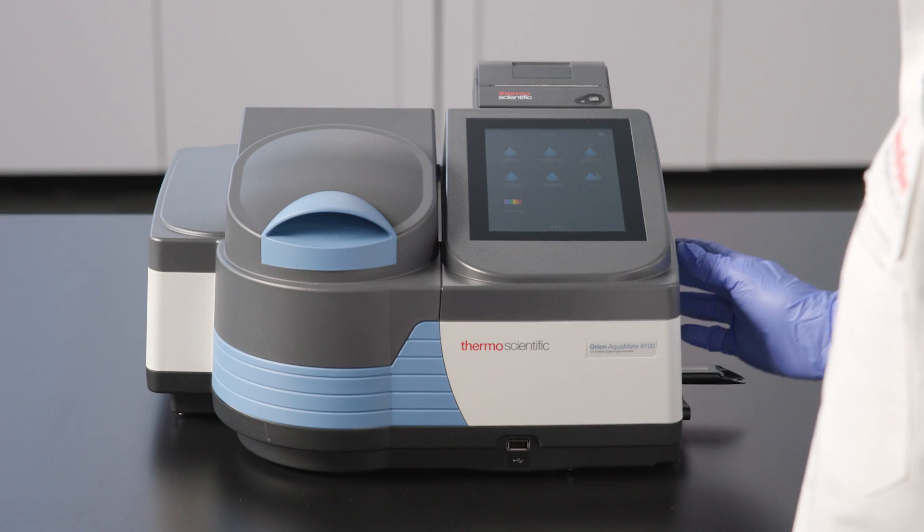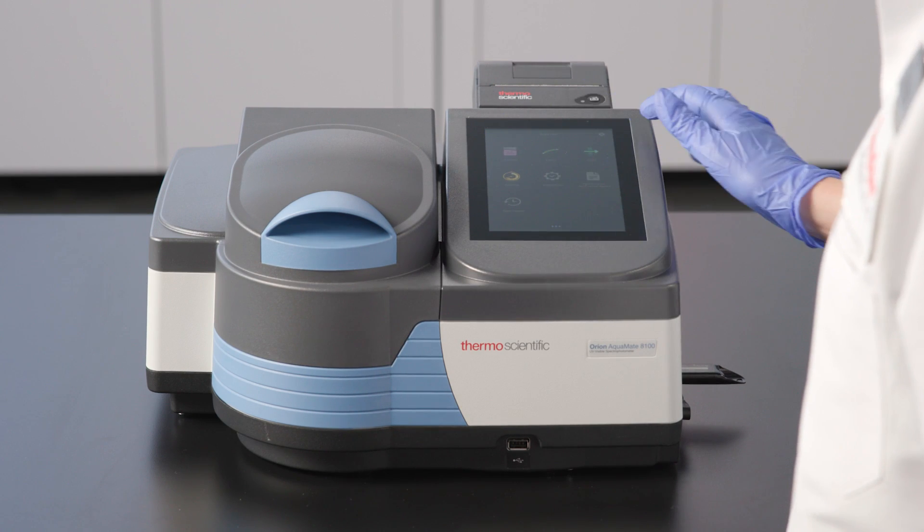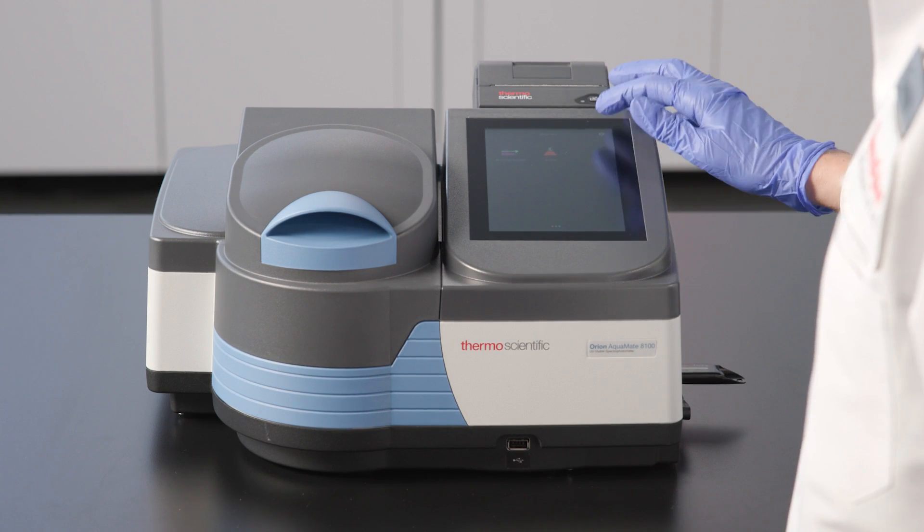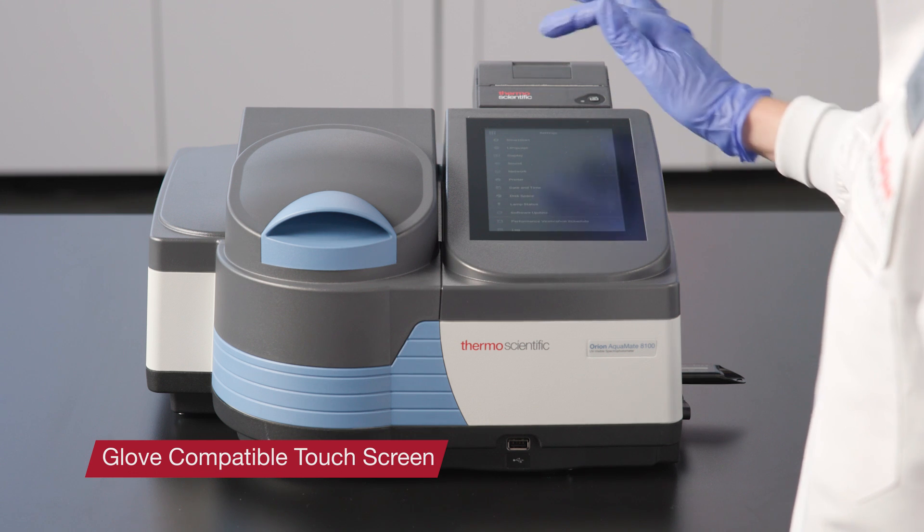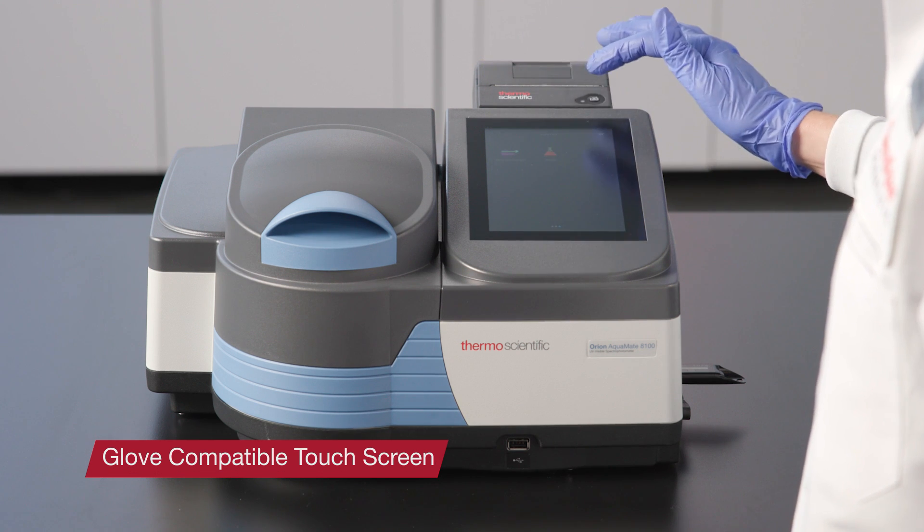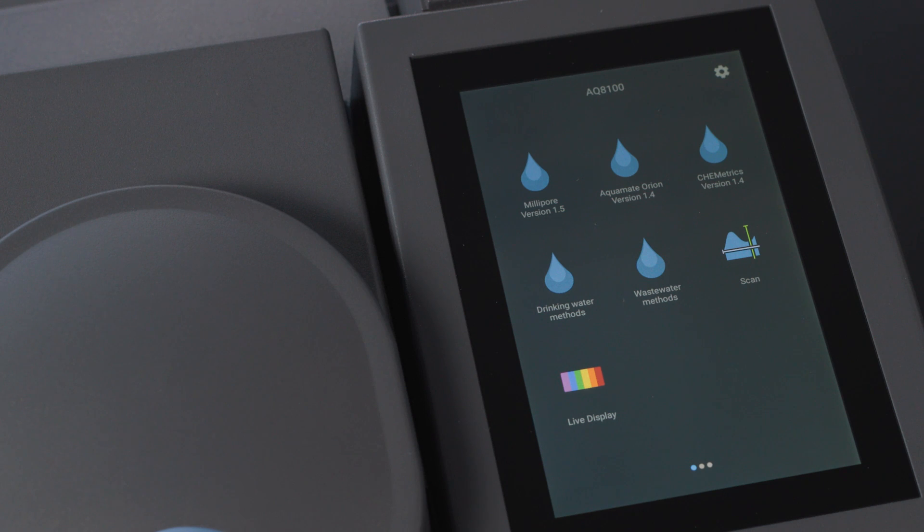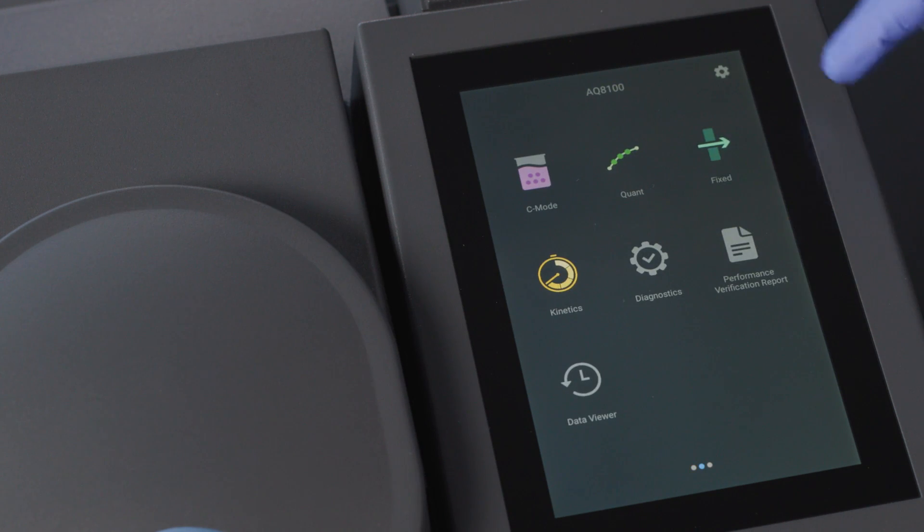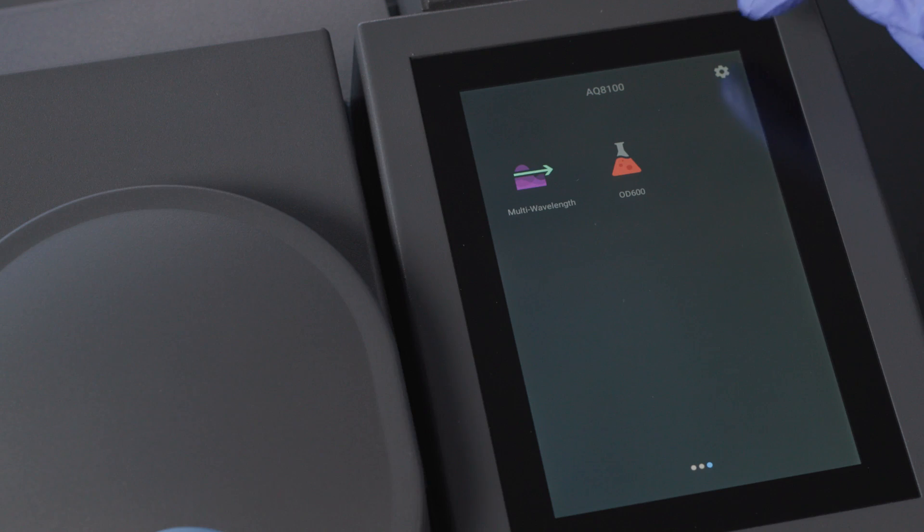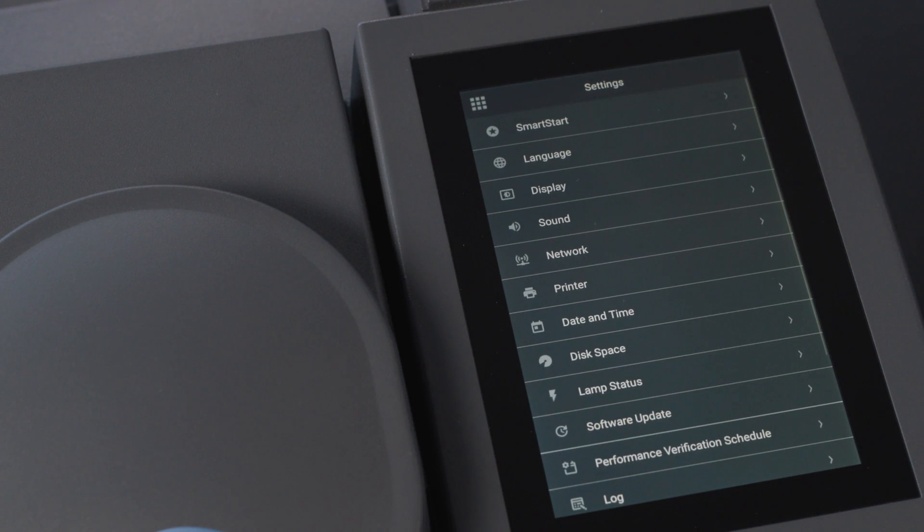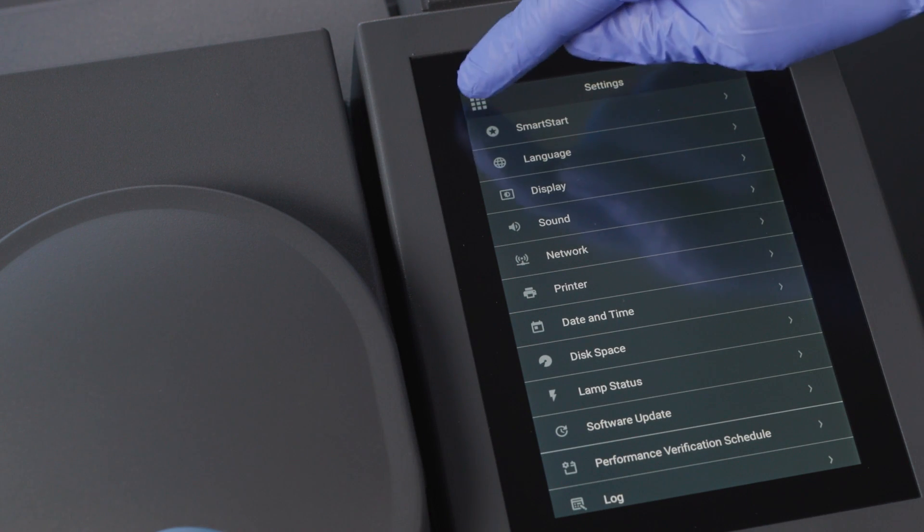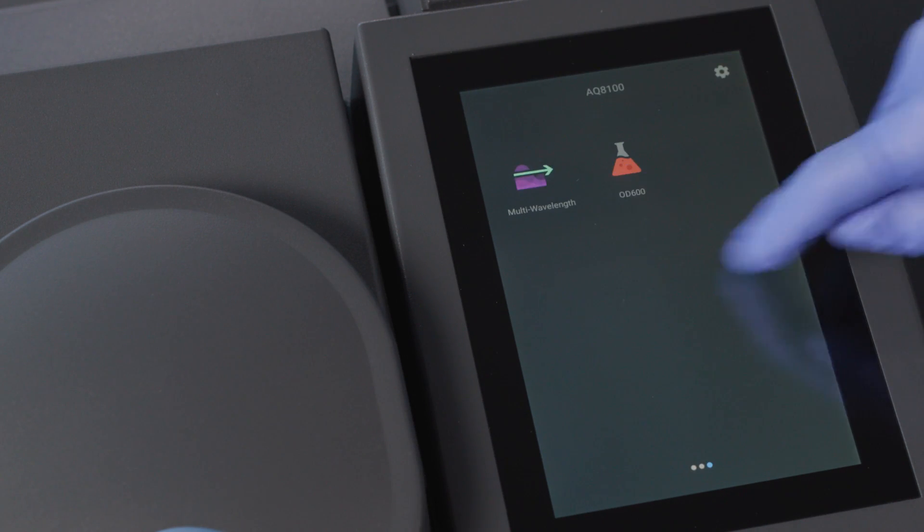One of the features we immediately notice when using Aquamate spectrophotometers is the glove-compatible touchscreen. This makes the instrument much easier to navigate and use than the previous model. The touchscreen has the same functionality that we are accustomed to with a smartphone or a tablet. There is a settings gear icon for accessing the instrument settings and a familiar icon to go back to the home screen.